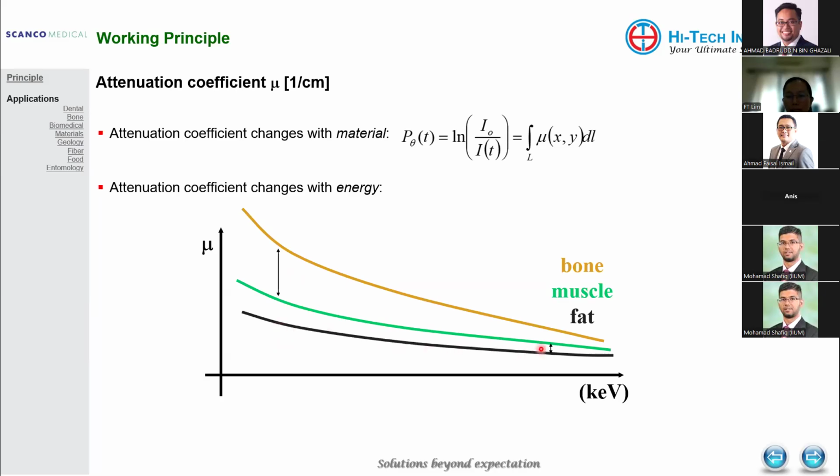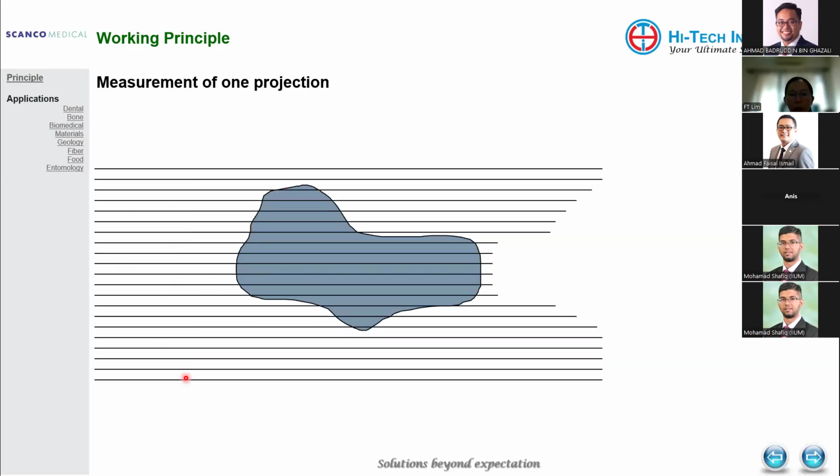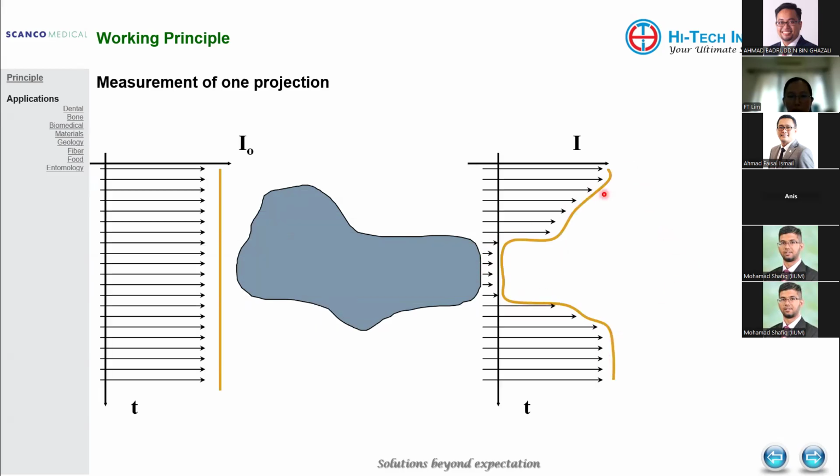But when it comes to high-density material like bone or tooth, it is good to go with a high kV. So this is how it works. Imagine this is your material and this is the X-ray. This area has a bigger volume, so more X-rays will be absorbed by this area. For the back projection, or the shadow, the signal that can penetrate through this object will be less, so you will see this shadow here. This is how you get it.